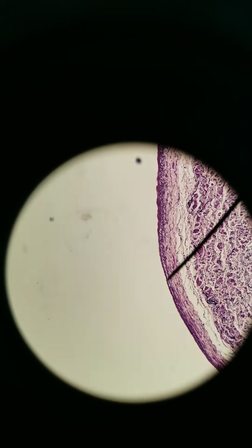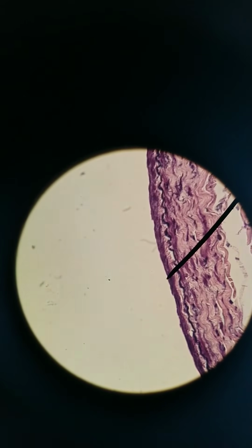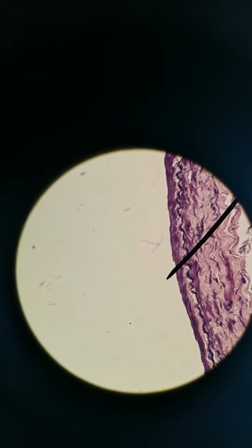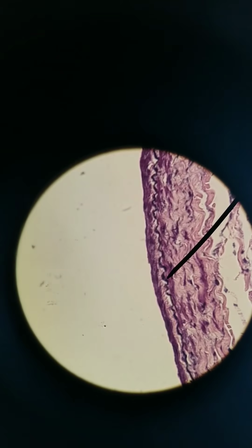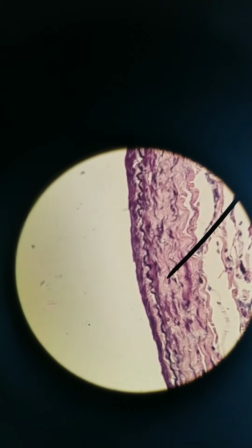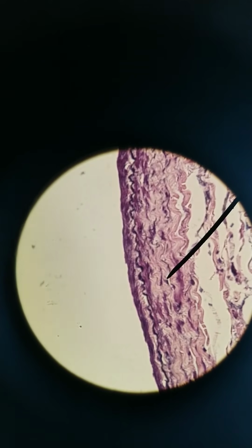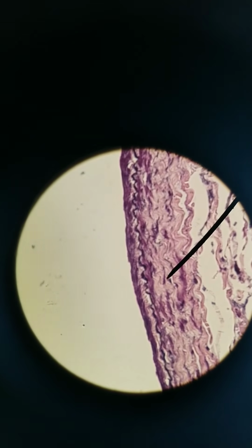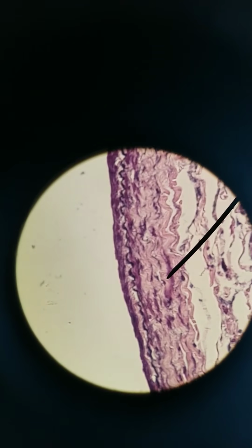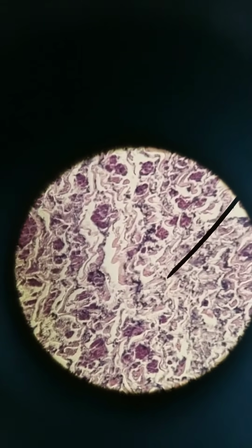So let's zoom in. We're at 100x. Now we're at 400x. Get in focus. There we go. Okay, great. So this first layer, again, endothelium and basal lamina. And then where you see this dark line, that's the beginning of where you have elastic tissue in the tunica media. It's not as big. With the aorta, and arteries in general, much larger tunica media relatively. So just from here to about here, that's tunica media. And then tunica externa is all of this.